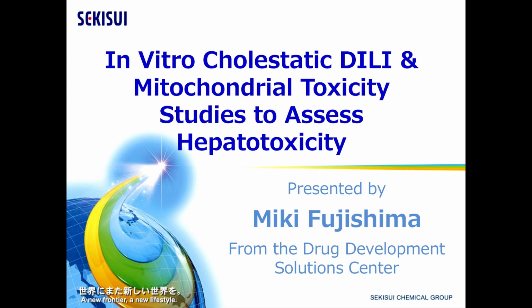Thank you, Jolanta. Today, I'd like to introduce the in vitro study options available to investigate the compound's potential to cause drug-induced liver injury. Specifically for cholestasis, we have a functional assay to determine bile acid-dependent hepatotoxicity and ROC analysis to compare test compound to non-clinical incidence of hepatotoxicity. We also have a short or long-term mitochondrial toxicity study.